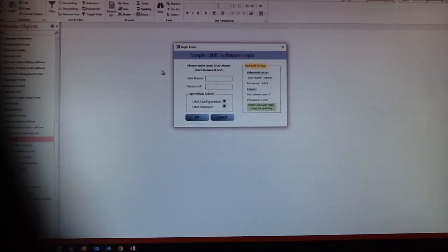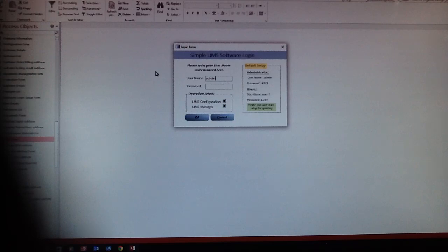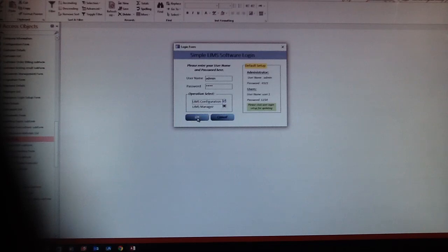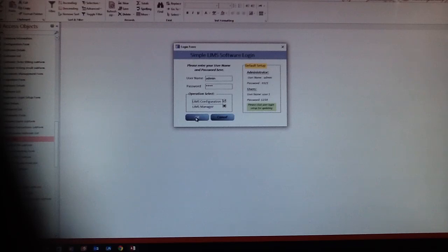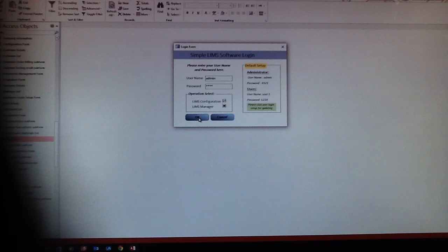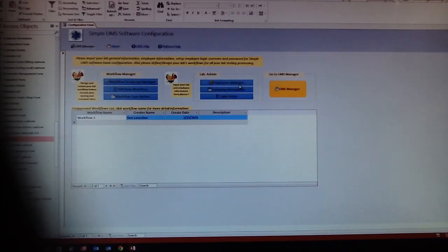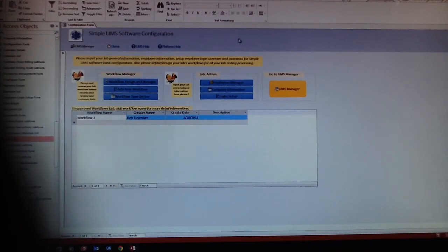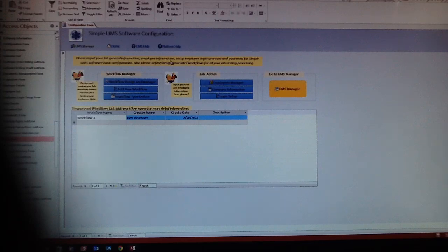You can type the username and password and pick LIMS configurations the first time, because you have to configure the LIMS software before you start to use it. After that, you can pick the LIMS management. Here is the SimpleLim Configurations dialog box.